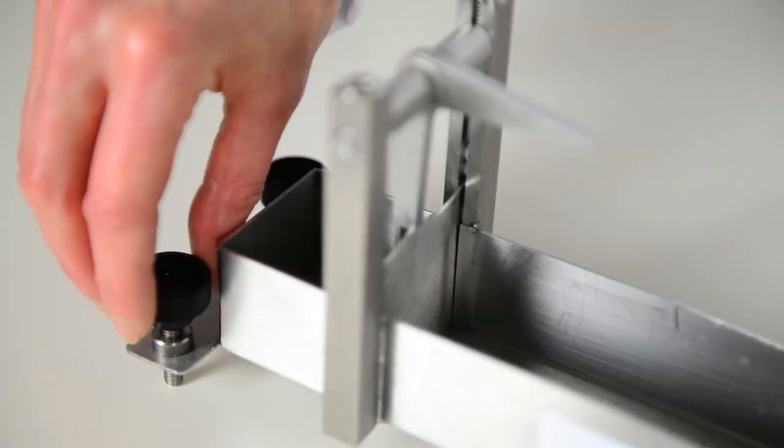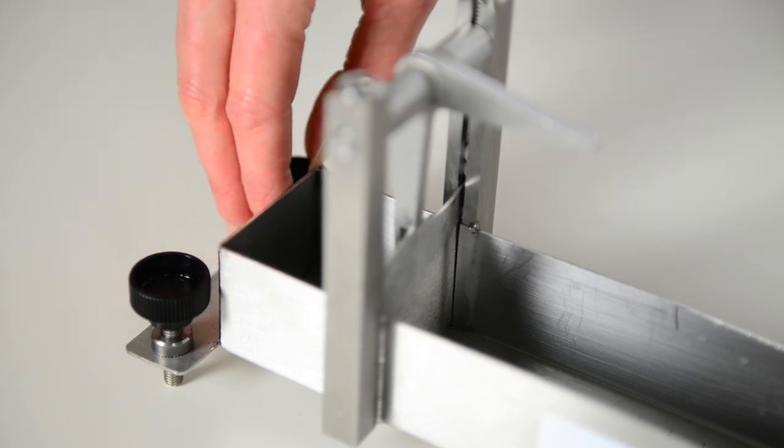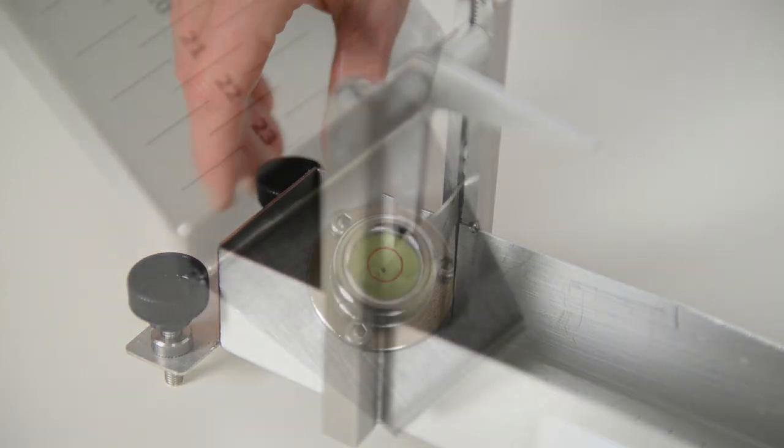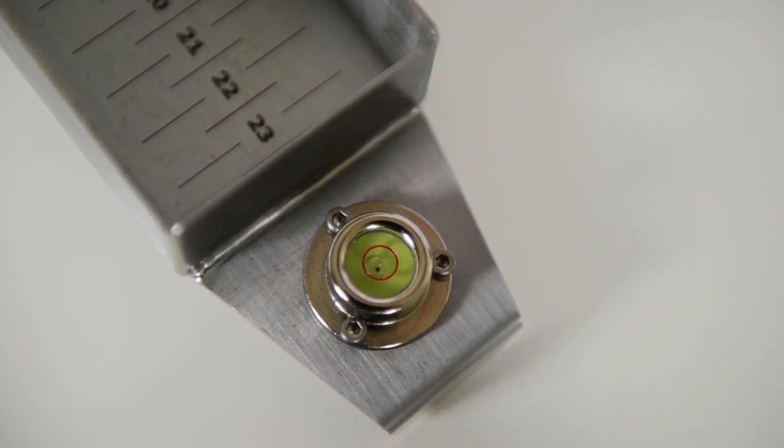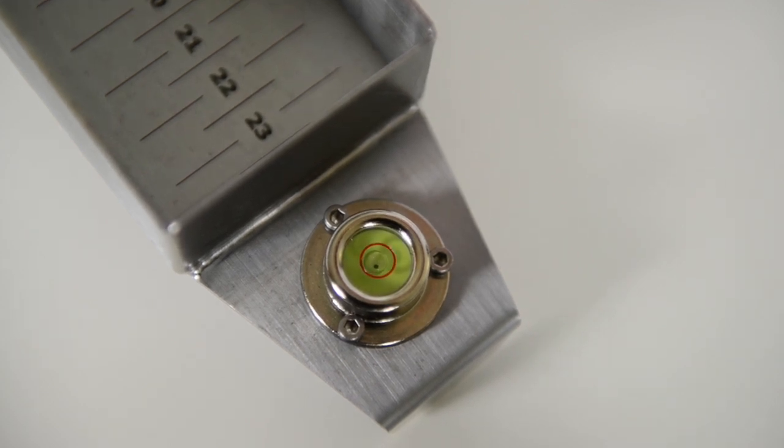First we need to make sure the Consistometer is level. Before we start the test we need to make sure our samples are at a constant temperature, for example 20 degrees centigrade.